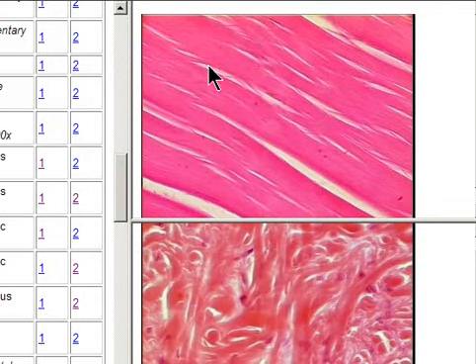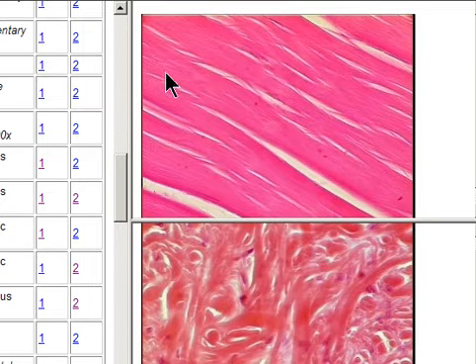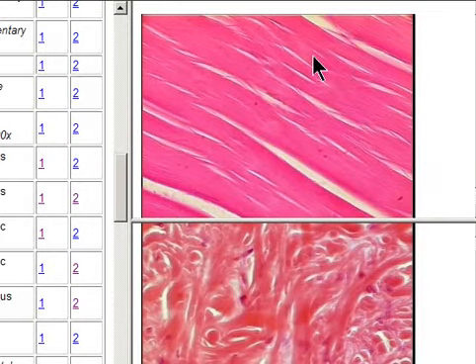here this is dense regular connective tissue. So look at these things. You don't see spindle shaped cells. These are just bundles of collagen fibers where the bundles branch, and you can see a few fibroblast nuclei, not even really well seen here.